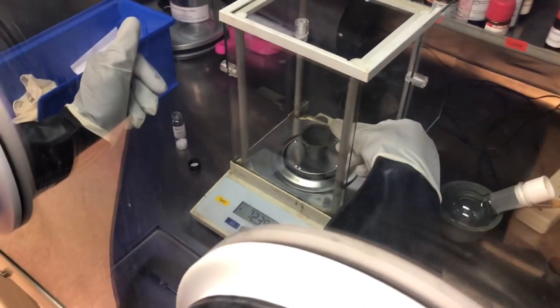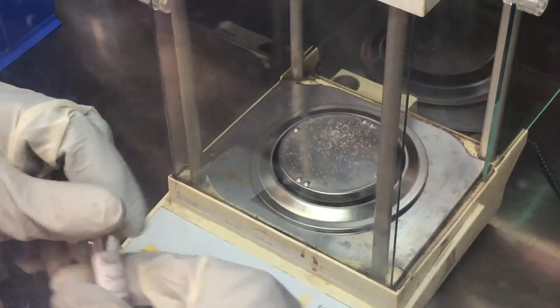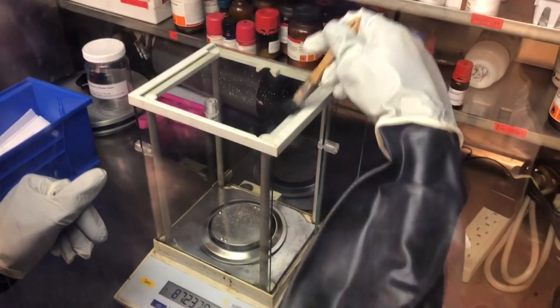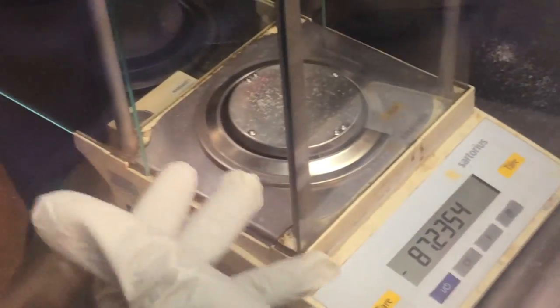Let's say tragedy happens and we spill our salt on the balance or next to it. We have to clean up the glove box after we're done working. Always start from top to bottom. We have a little brush here — you might throw some particles to the back.